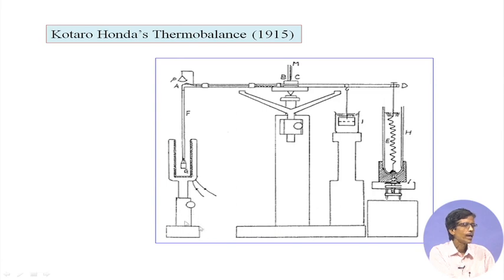So, if you have some mechanism such that we can measure this, and G is the sample holder, you see there are two wires, the electrical coiling, such that this particular part is your furnace. First it was developed in that way. You simply heat the furnace, so your sample will be heated and we want to see the weight change with temperature.